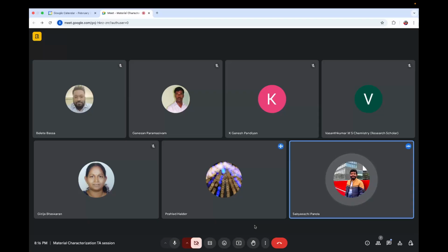In that graph, we take a specific band, a specific magnification range. Only within that specific magnification will we be able to view the image, and beyond that we are not able to use the image, because beyond that the criteria for empty magnification takes place. That is why the 500 to 1000 range is defined for a useful magnification.